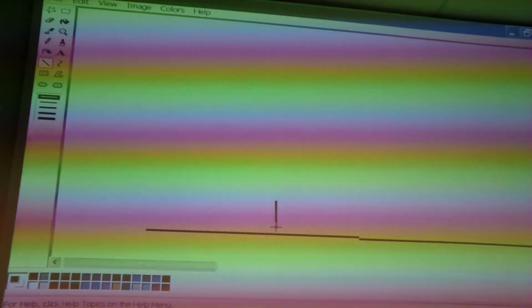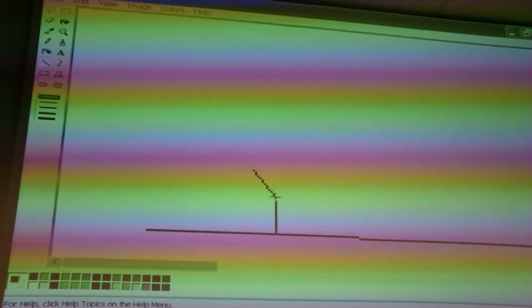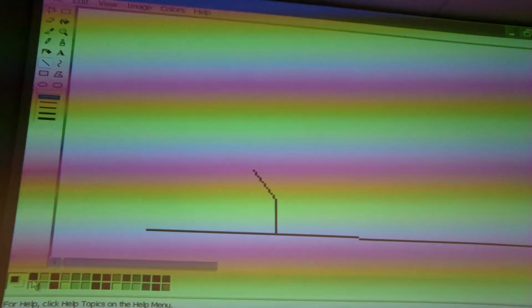Okay. So I'm going to draw a catching antibody. Very clumsy with this, sorry about that. So this is the FC. I'm not going to paint all the heavy and light chains, but you can easily follow this.